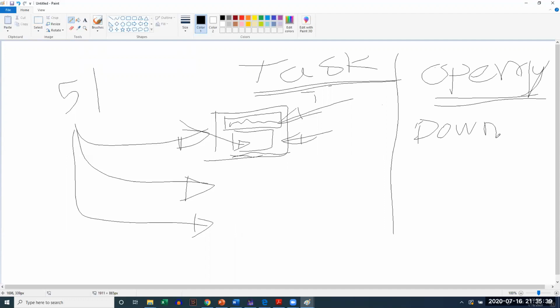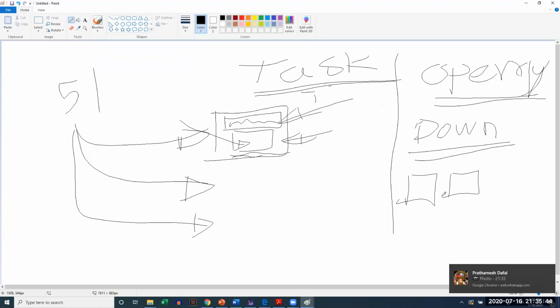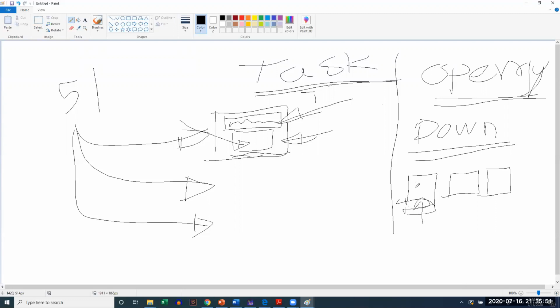Whenever you download, create a separate folder which we can use for supervised learning later. Name this folder for that particular gel image, whatever it is for, and the corresponding DNA number should be noted. There could be different folders for different kinds of images. If you get a big data set of gel electrophoresis images, nothing like it, you can start working directly. But right now I want you to take baby steps.